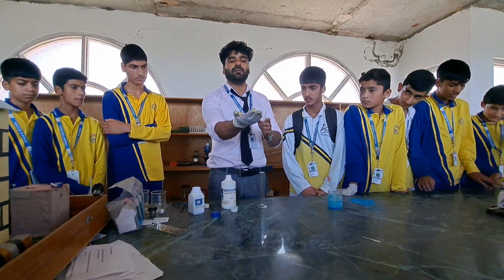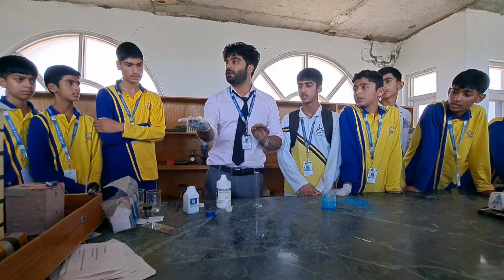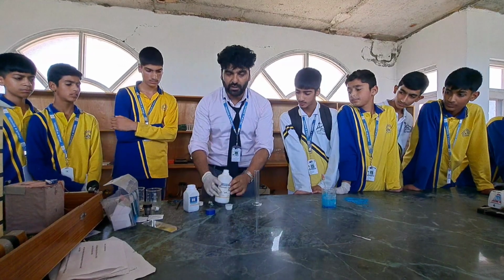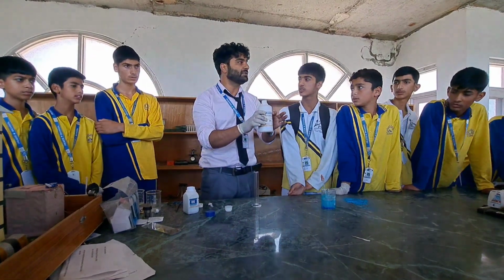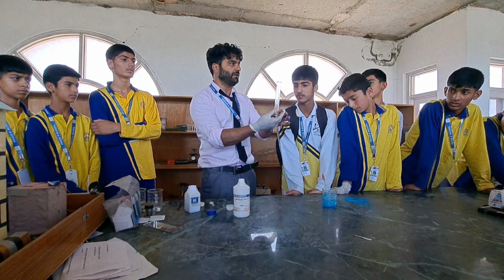So what is this in my hand? Zinc. What are they called? Zinc flakes. What is in this bottle? Dilute sulfuric acid. Okay, this is the flask, kind of a tube flask.